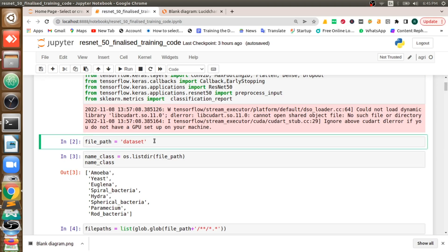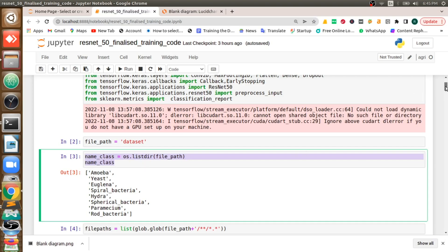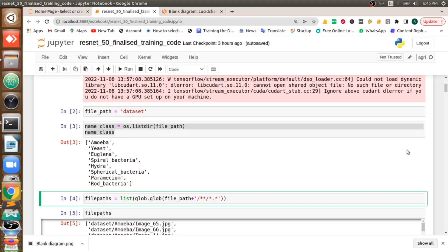So here what we will do is we will give the path for the dataset. I am going to list out what are the classes we have: amoeba, euglena, spiral bacteria, hydra, spherical bacteria, paramecium, and rod bacteria.